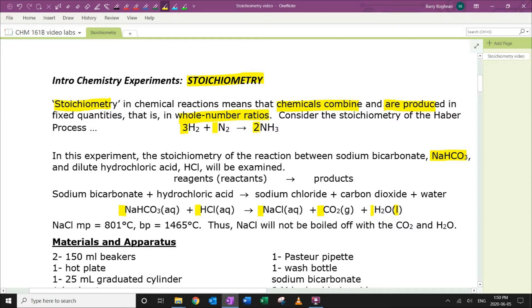Now, we'll make sure that we add excess HCl to ensure that all of the sodium bicarbonate is reacted. And we're left, then, only with sodium chloride, carbon dioxide, and water, and a little excess HCl.